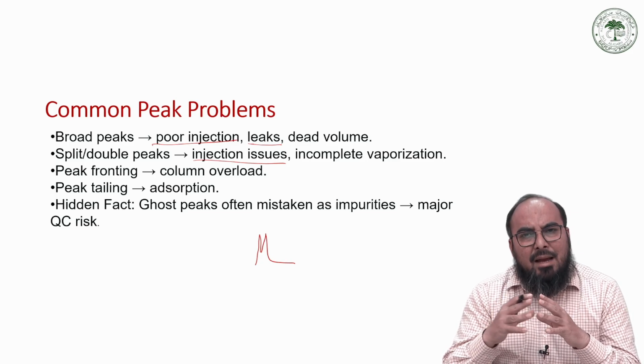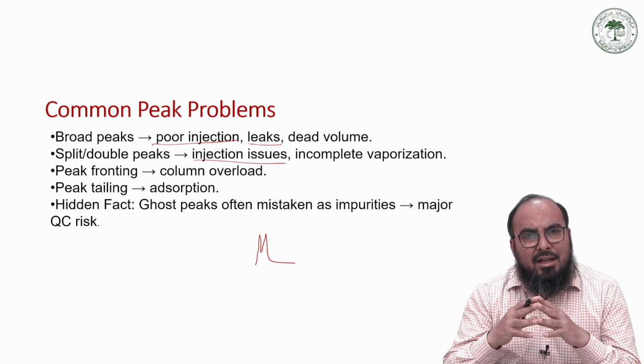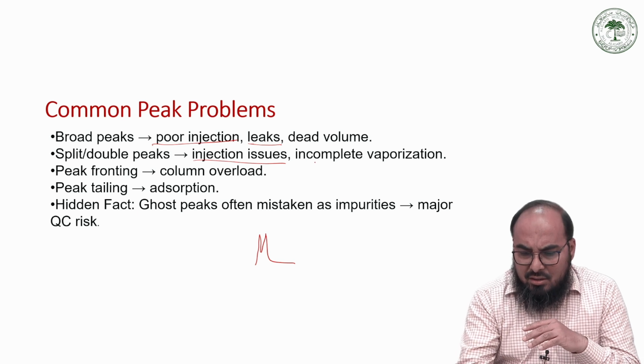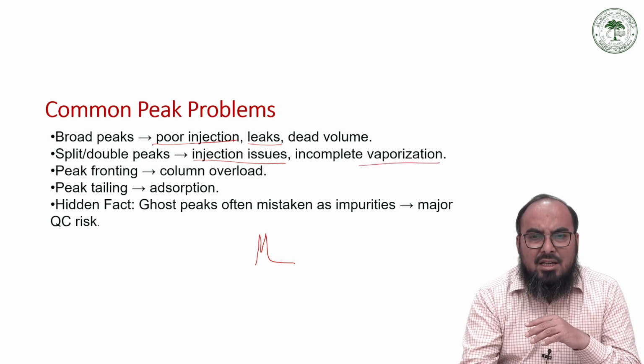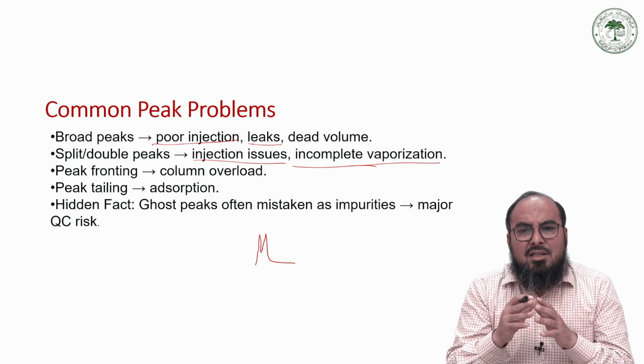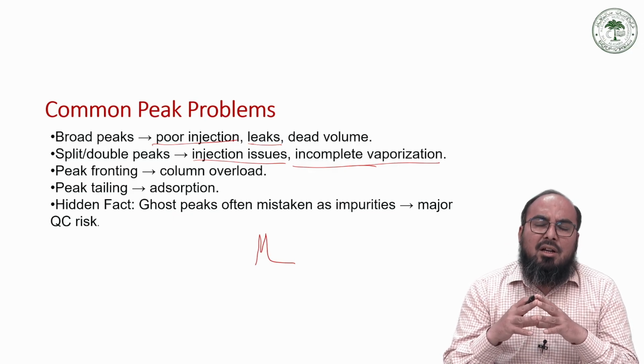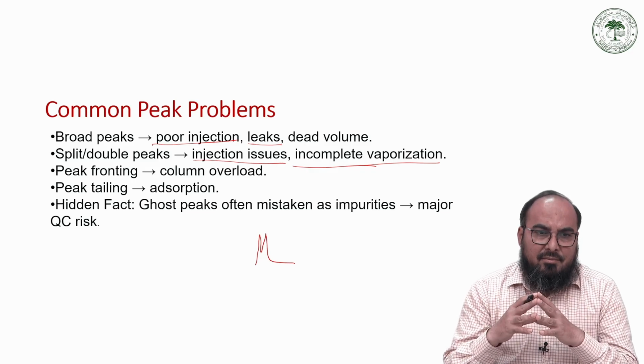Similarly, if your sample was in liquid state and you are getting a double peak or a split peak, then there are chances that your sample does not get completely vaporized. That is, you have incomplete vaporization of the sample. Your sample actually did not get fully vaporized.